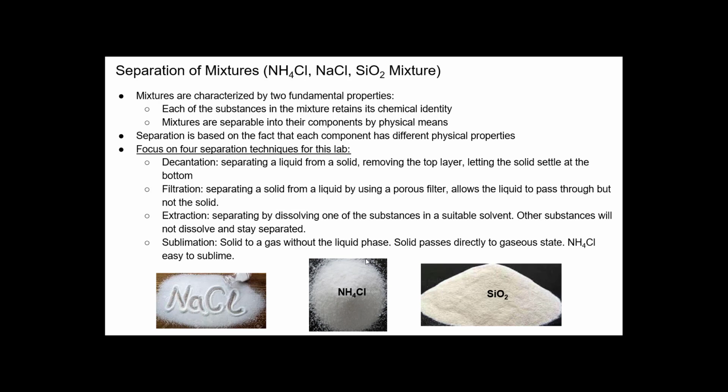Based on their own components, you can look at what the salt does, what it can do, and based on physical properties, you can figure out how to separate these from each other, which is exactly what is done in this lab. You want to make sure that you understand the physical components of it, because understanding that will allow you to use certain techniques that wouldn't work with other things, such as, for instance, water will dissolve salt, but it will not dissolve sand.